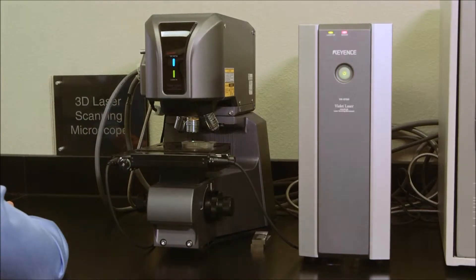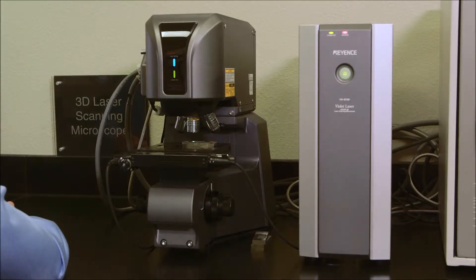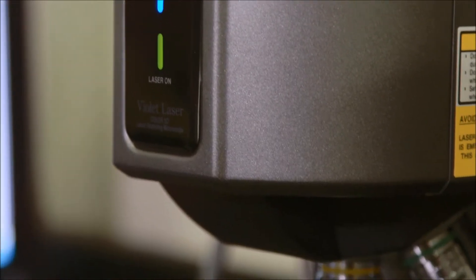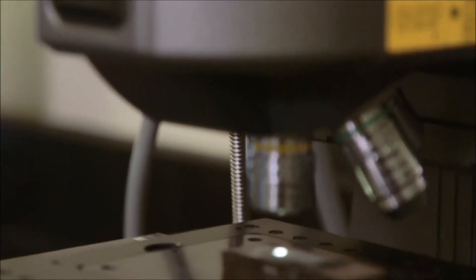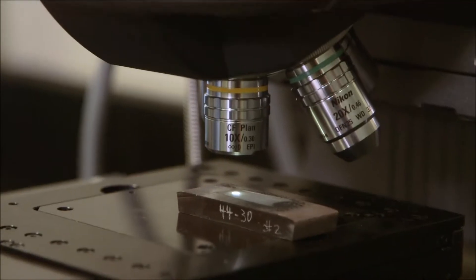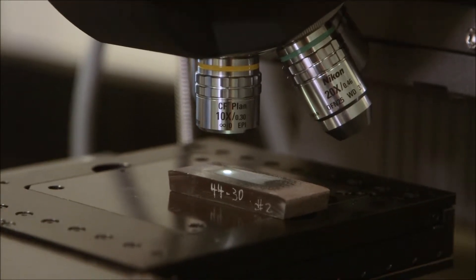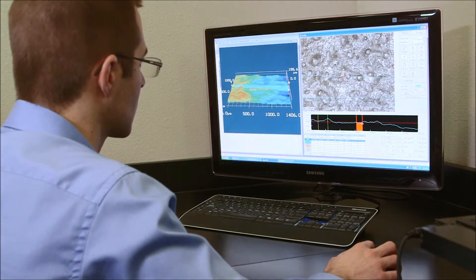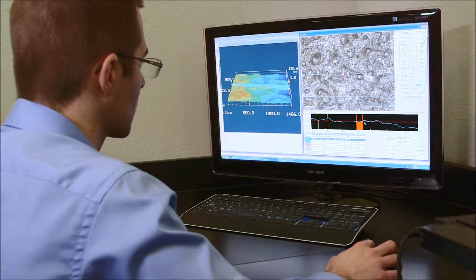Another very unique piece of equipment we have in our microscopy room is our Keyence VK9700 3D laser scanning microscope. And what this microscope can do that our SEM can't do, that our Axiovert 40 metallograph can't do, what our stereo microscope can't do is this microscope can basically characterize the surface topography of a worn surface from the field.